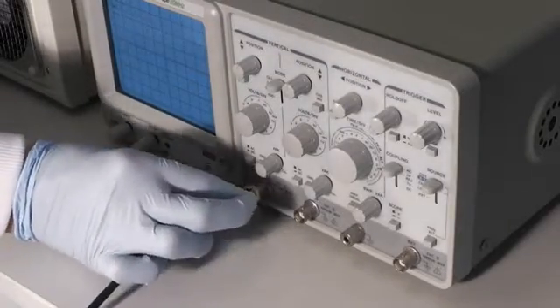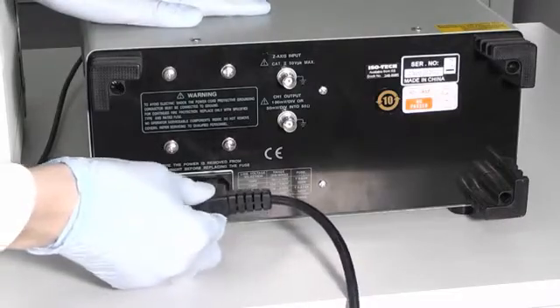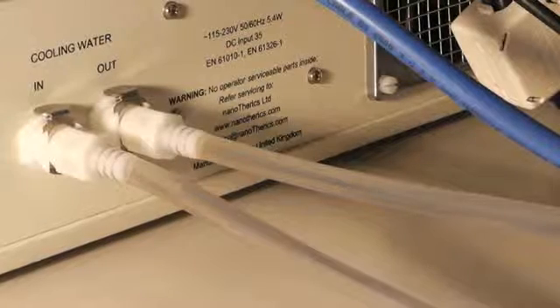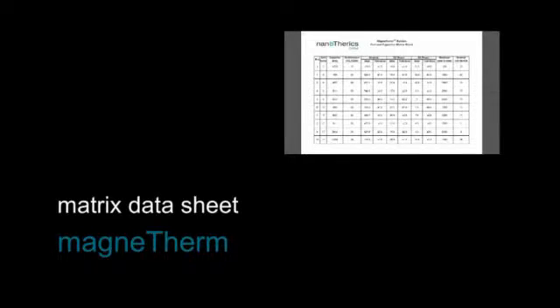Before switching on the system to run your magnetic nanoparticle samples, make sure everything is connected properly once again. Especially make sure that the water inlet and outlet is OK, as the coil enclosure will not switch on if they are not connected properly, or if the water inlet pressure is below or too far above 320 milliliters per minute.